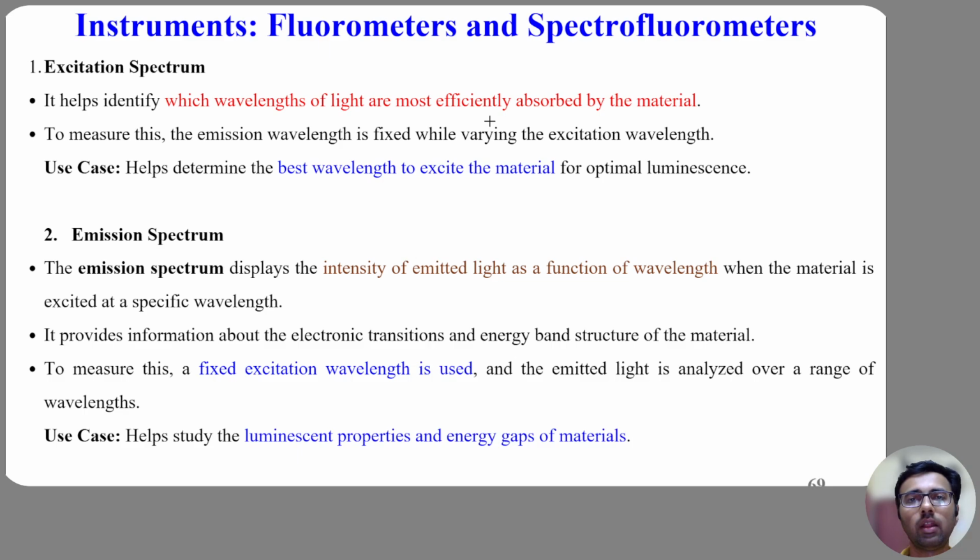Now consider the emission spectrum. Here we reverse the process. We fix the excitation wavelength at an effective pumping value and scan the emission monochromator across longer wavelengths.